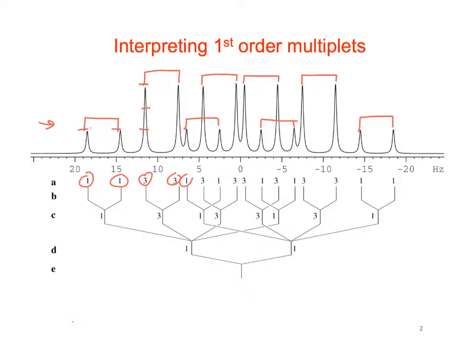Okay, so in this, what they do is they bring these together, right? These come together. That's how the first doublet was. The bigger one is here, the small one is here, big, and so they're this 1 to 3 to 1.